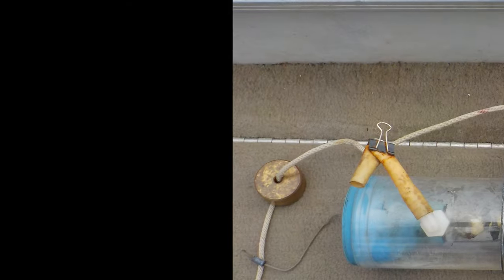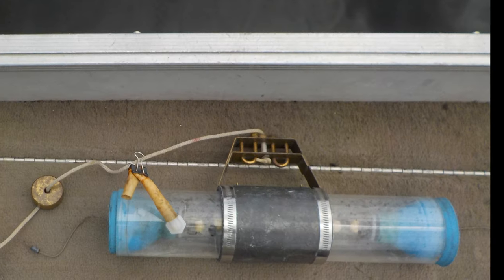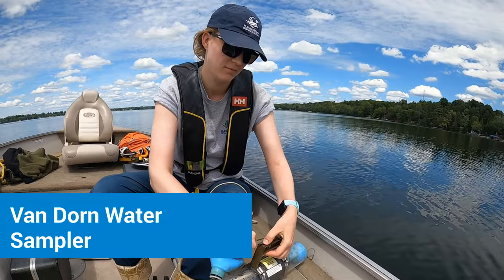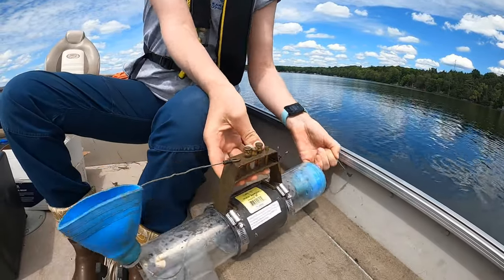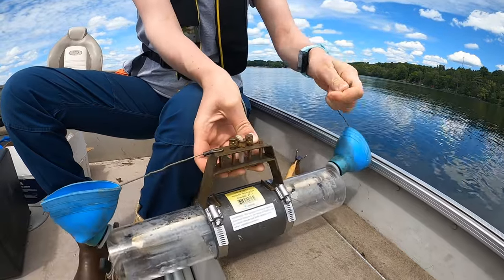Welcome to Kawartha Conservation, where protecting our water resources is at the heart of what we do. Today we invite you to discover an important tool in our water quality monitoring arsenal: the Van Dorn water sampler — a specialized device used to collect water samples from different depths in lakes, rivers, and other water bodies.